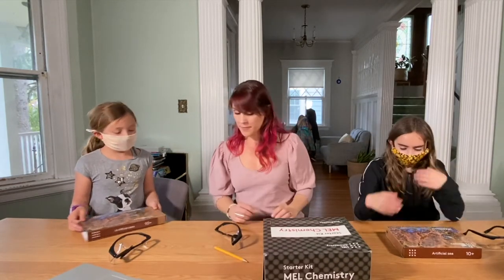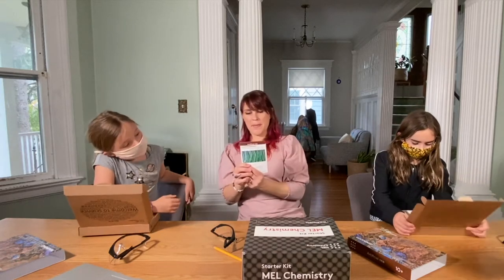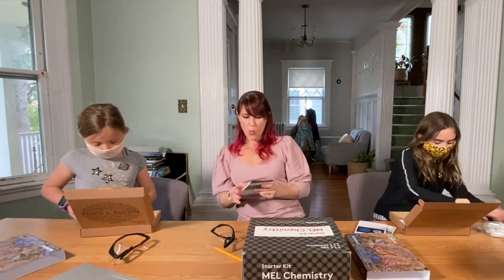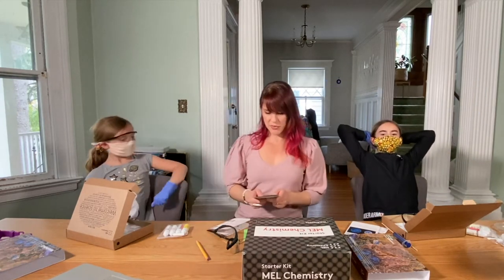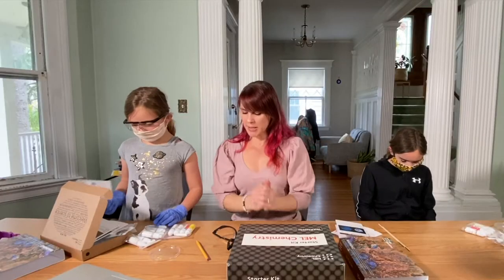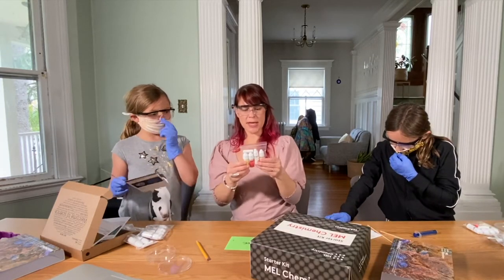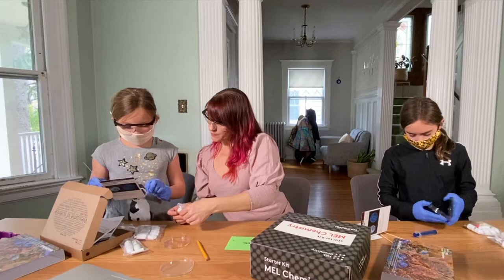Let's go ahead and open up our kits. We have these little cards, and it tells us what the experiment is. In the back, it shows how these different atoms start interacting with one another. So which one should we do first? Jellyfish looks like the one to do. What supplies do we need? The Petri dish. See how Mel Chemistry organizes this — each experiment is put in its own little bag, nicely and neatly organized. We need the blue, the purple, and the red.